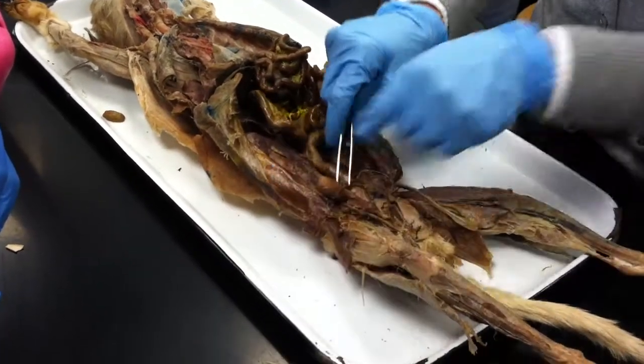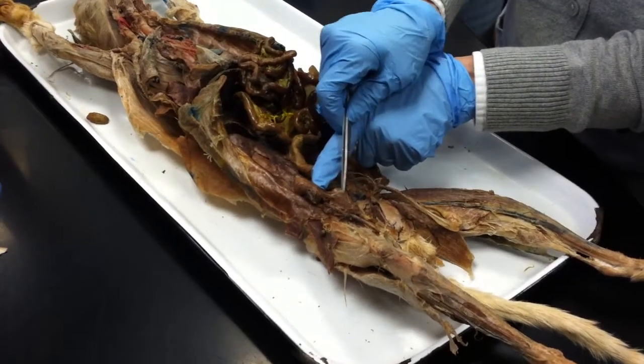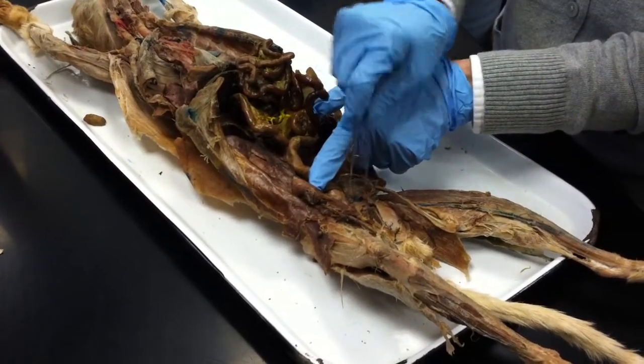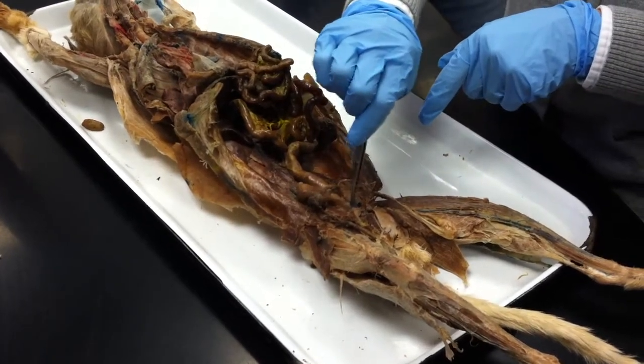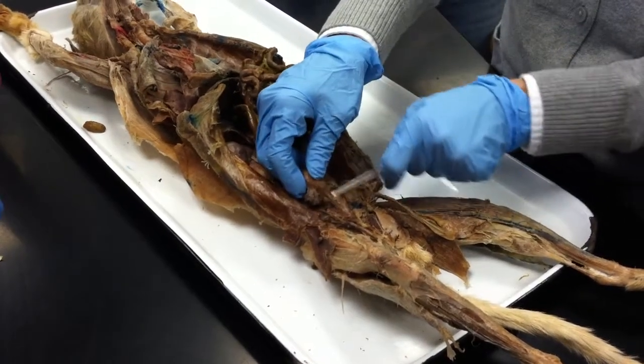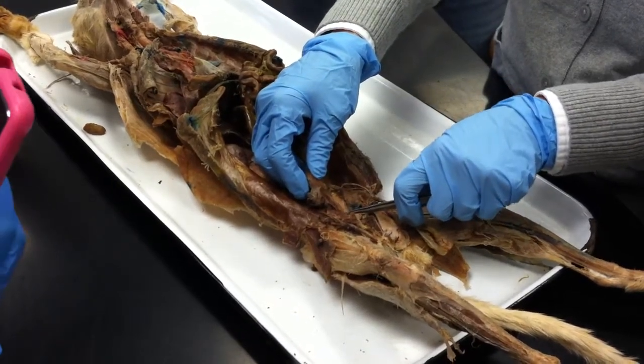Yeah, okay. It's a little hard to see. But the spermatic cord comes down, and right about there, it dumps into the urethra. Okay, this is the urethra coming out of the bladder. The spermatic cords join with the urethra down here. Okay.